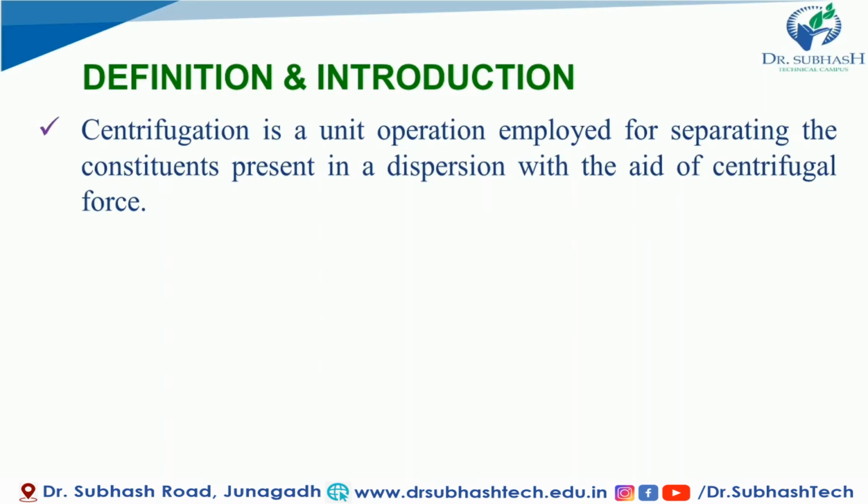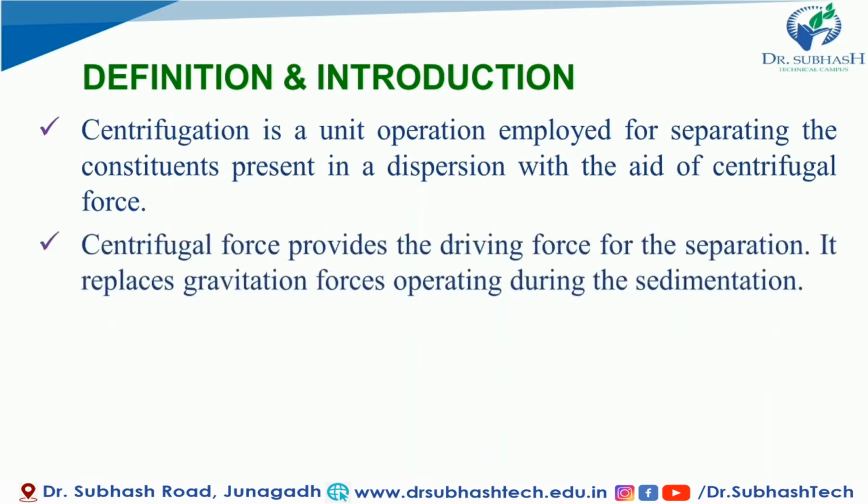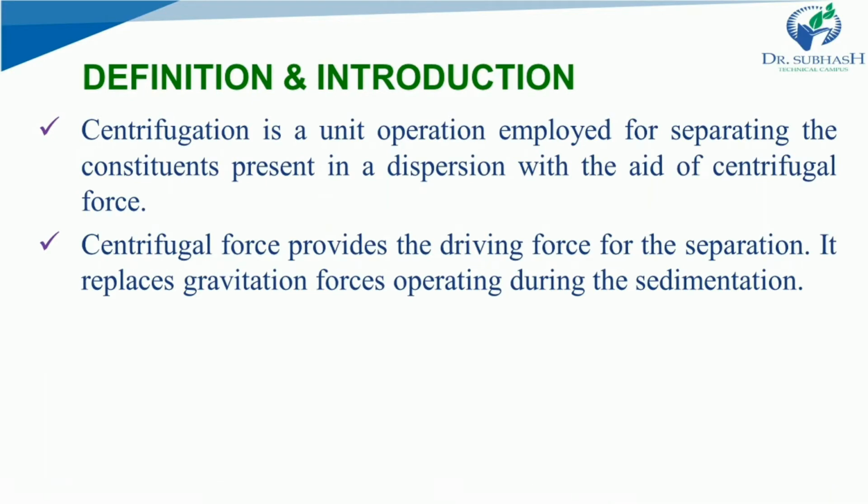I repeat, centrifugation is a unit operation that is employed for separating the constituent present in a dispersion with the aid of centrifugal force. So here what are you using? You are using centrifugal force, right? Centrifugal force provides the driving force for the separation. It replaces gravitation forces operating during the sedimentation. You might have heard that centrifugal force is way too much stronger than gravitational force.